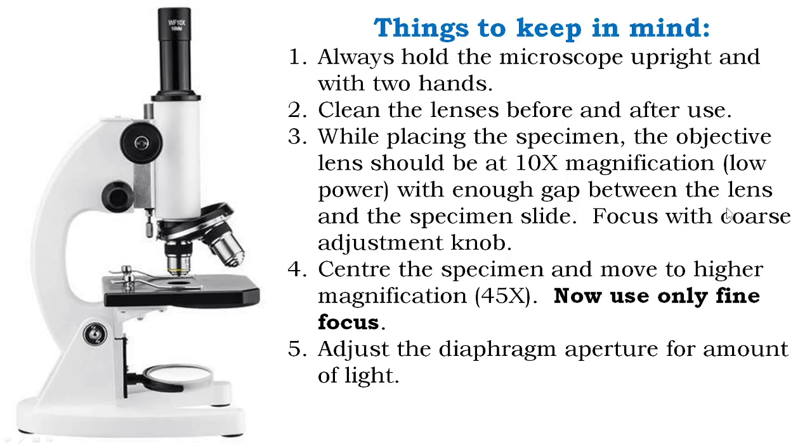And then you can use the coarse adjustment knob to focus. Coarse adjustment di pijuche ni kiran chala di specimen sha yo di kare image shu mara wo di ka la focus shi a try chena digir. Ta di focus os cha su samruwa. Then you just put the specimen right in the center of your field and then move to higher magnification.